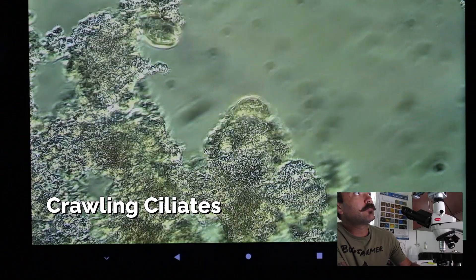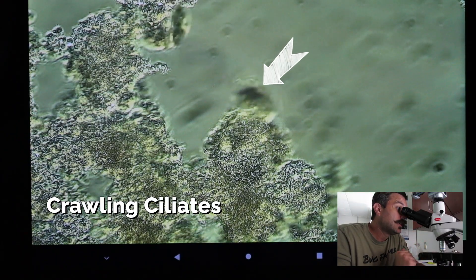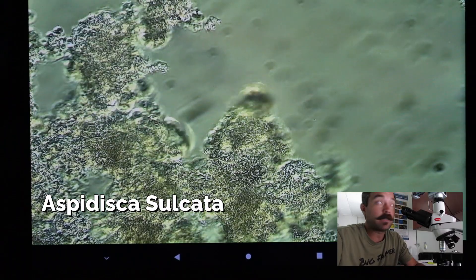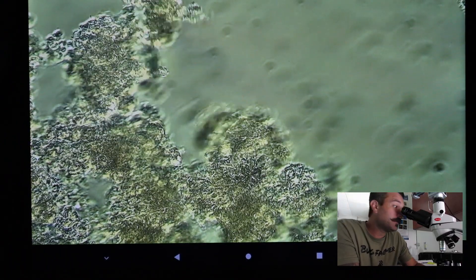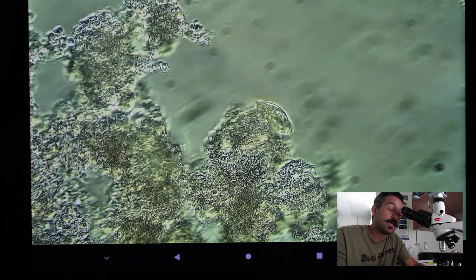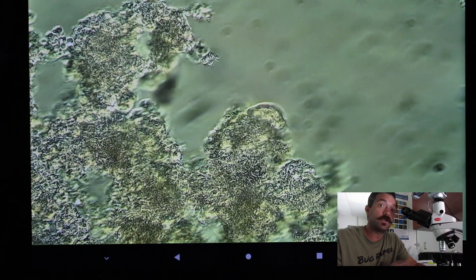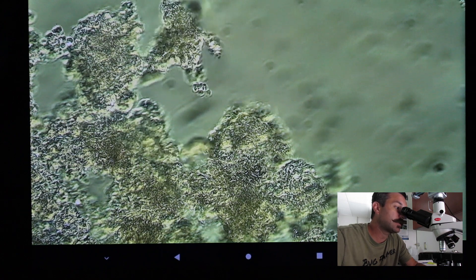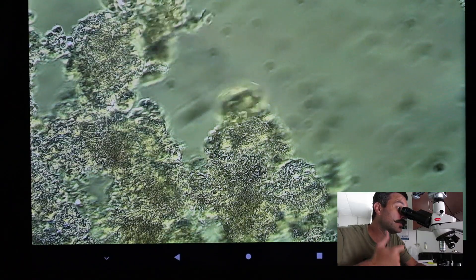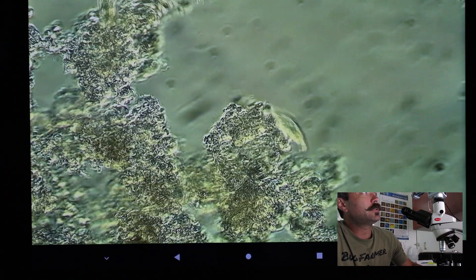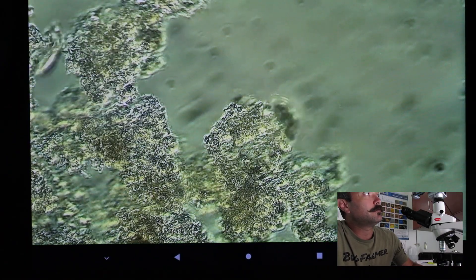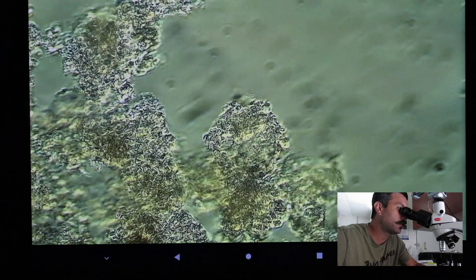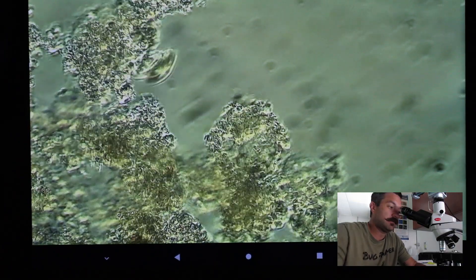These moving organisms on screen are crawling ciliates - I'll put their real name on screen. These guys are a good sign in your process too. It's good to see diverse life when you're looking under the microscope. You want to see a good mixture - not all just one bug, not no bugs. You can tell how excited they are: that means they've got plenty of air and plenty of food. They're just crawling all around.